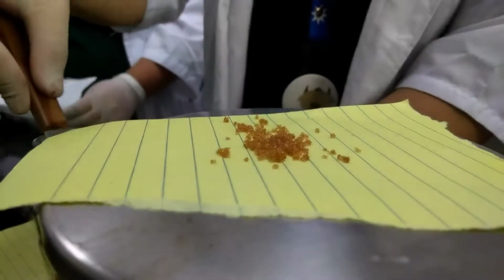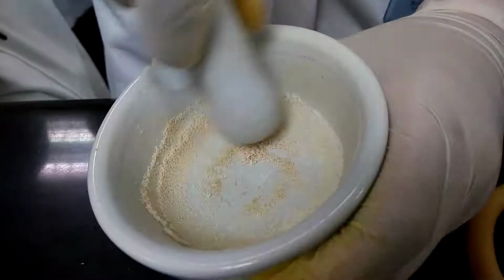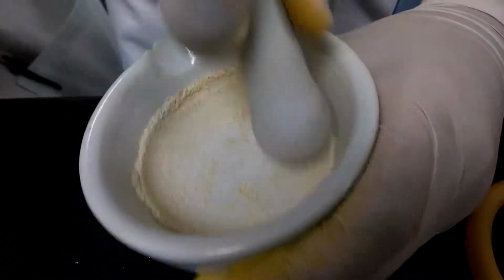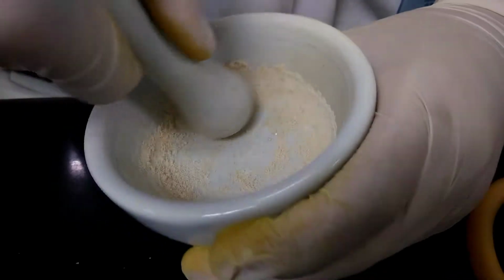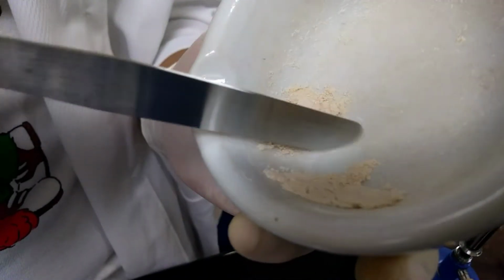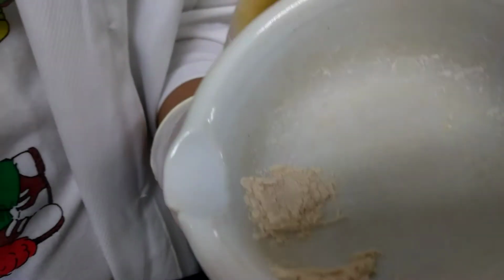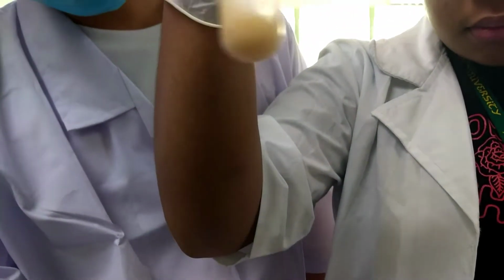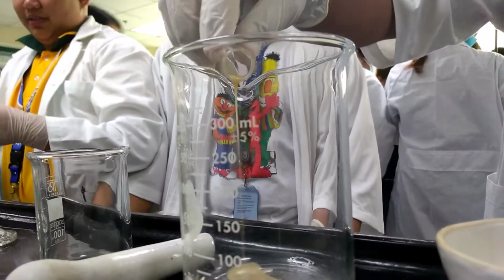For the procedures, we'll start with the steps for dissolution and filtration. Step 1. Mix 0.5 grams of benzoic acid and 0.5 grams of brown sugar in a mortar. Divide in 2 equal portions. Step 2. Transfer 1 portion to a test tube and add 1 milliliter of ethanol. Shake well and decant the liquid to a beaker.